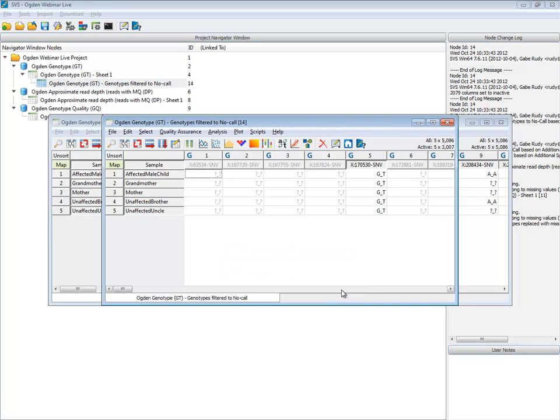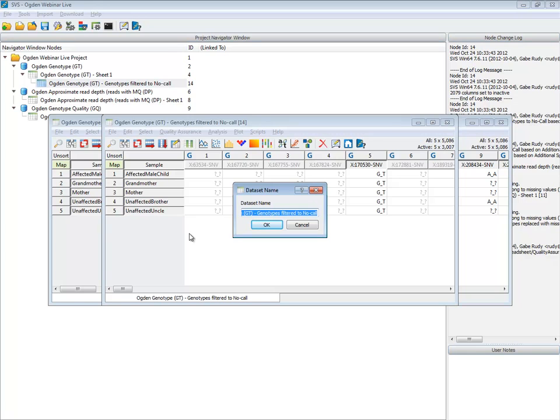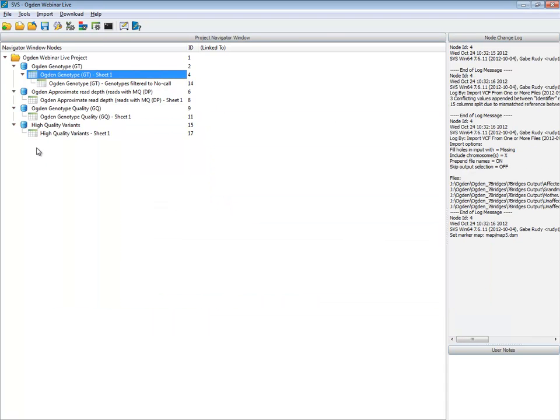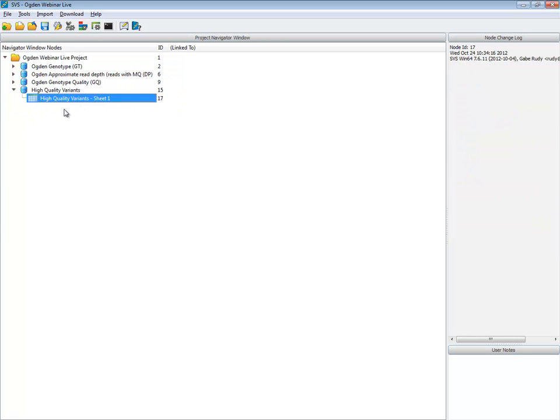Let's say OK, and I'm going to preserve this spreadsheet as a top-level spreadsheet for our further analysis, and give it the name high quality variants. I can close out everything else, and we'll start with this high quality variants when we get going. You can see in SVS we build up a history of all the things we've done: we've imported the genotypes, read depths, genotype qualities, and now we have our high quality variants.